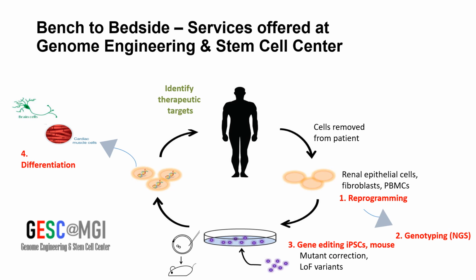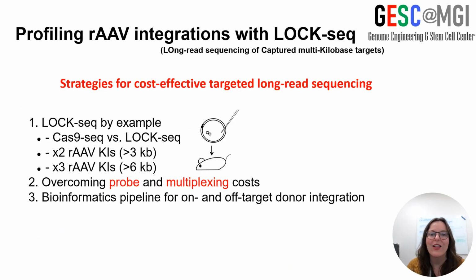genotyping method. For today's talk, what I'm going to focus on is specifically mouse model creation, and I'll also focus on LOCK-seq, which is a long-read method to accurately assess multi-kilobase knock-ins. LOCK-seq stands for long-read sequencing of captured multi-kilobase targets.